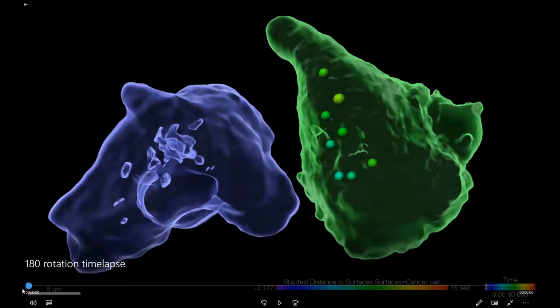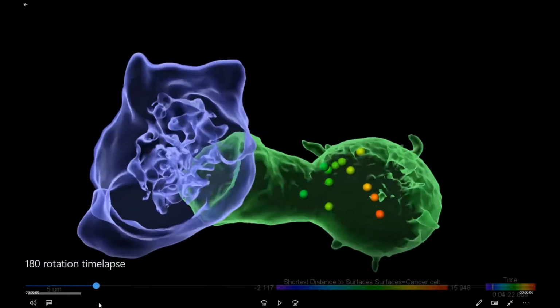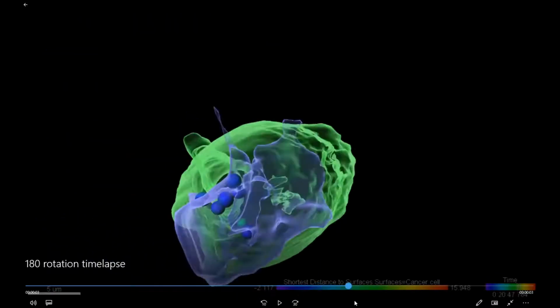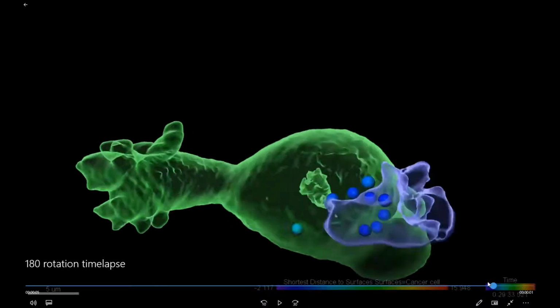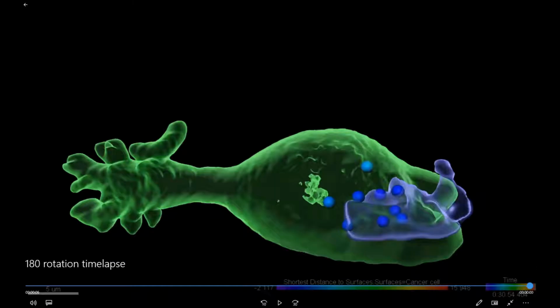You have the initial time point and you see that the time lapse is played from the start, but also cells are rotating around their axis, so they finish here. Okay, so how to do this?